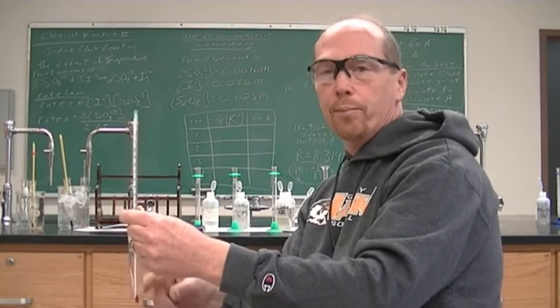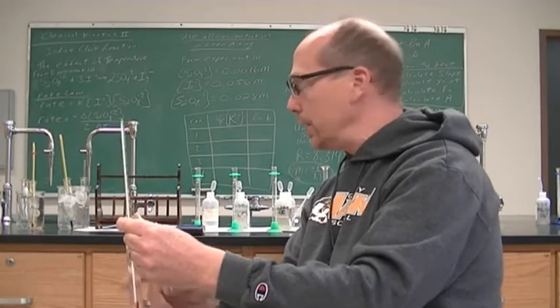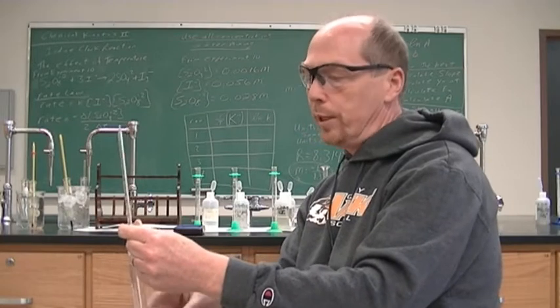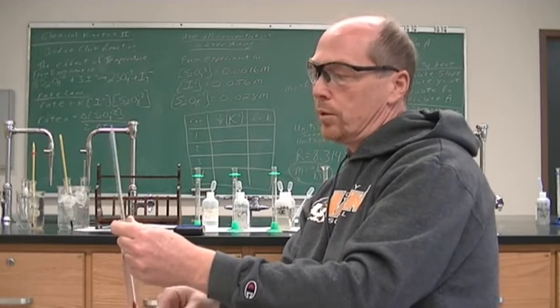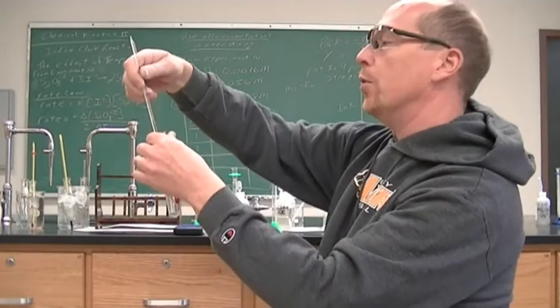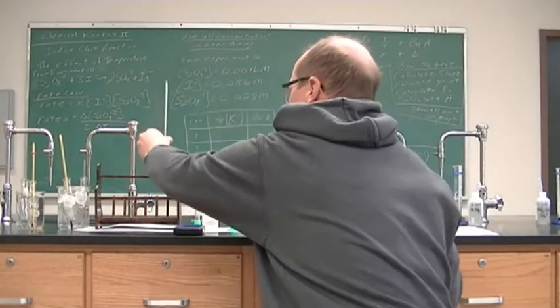So each time I mix one of these up in a test tube, I'm going to keep mixing them until my reaction time is 1 minute. So I'm going to try to be consistent on my mixing. And then I will also be monitoring my temperature. So we're at the 1 minute mark. Yeah, so 22.0 is our temperature.